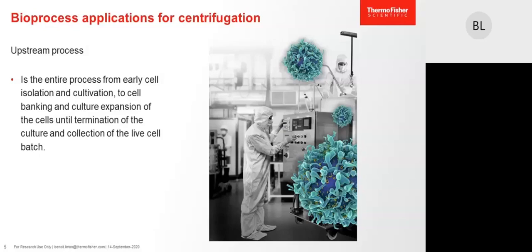At the end of the upstream, there is a vessel, maybe ranging from 1 liter up to 10,000 liters, depending on the size of the industry or the target of the product and the phase, if we are in development, in research, or in mass production. And we have living cells in the culture media, and one or the other is containing the product of interest.